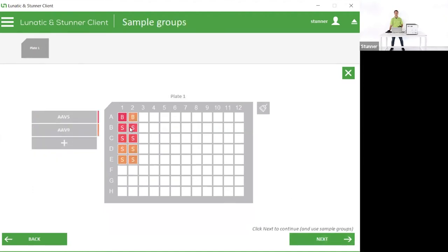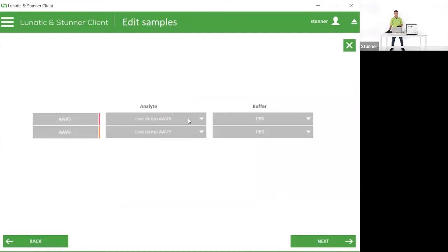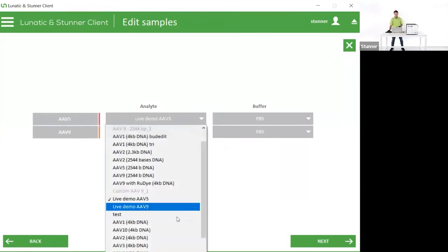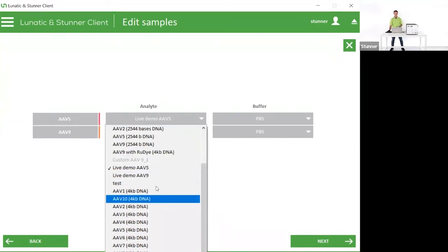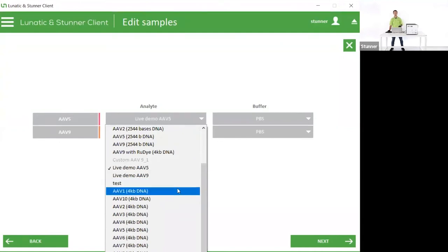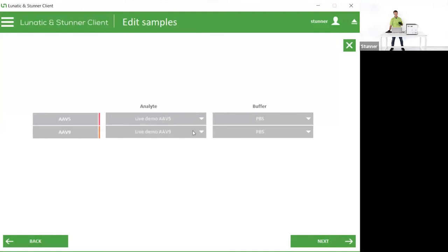Next, we get into the sample group screen. This is associating one blank with each sample group so that it knows these four samples are associated with that buffer blank, and these orange samples here are associated with the other buffer blank. It also lets me define my sample groups - I've just named them AAV5 and AAV9. But on the next screen, I'll assign the analyte to each of those groups. Because I've loaded this from my Excel, the software already knows that for my AAV5 sample it's running the live demo AAV5 analyte. I could very easily pick a different analyte from any one of the ten serotypes that are pre-programmed in Stunner, or by making a custom AAV with a different length genome.